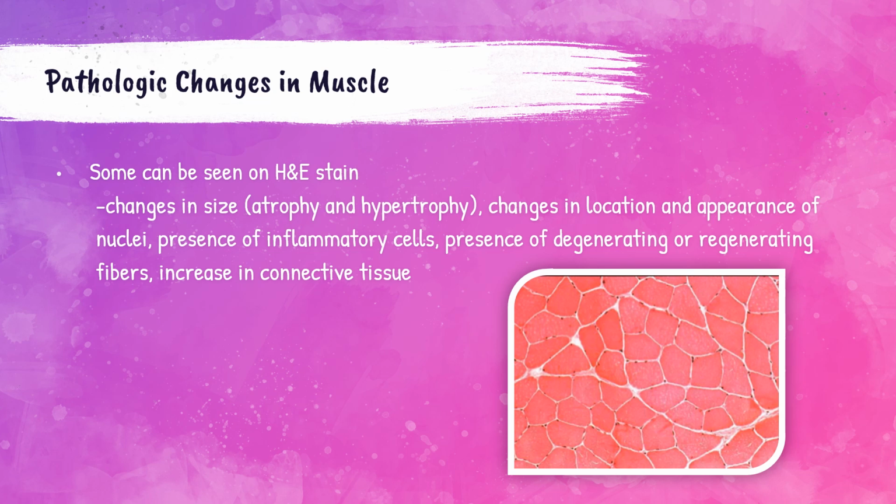So each of these, I'm going to use, let's use blue. So each of these are the muscle fibers, and they're all pretty uniform, right? Okay, so this is normal, okay?